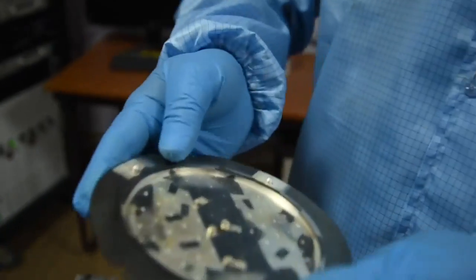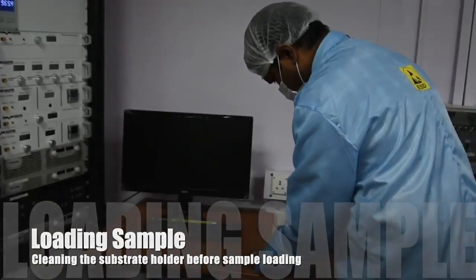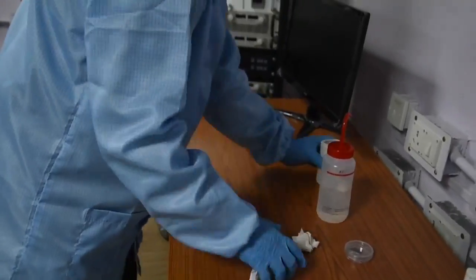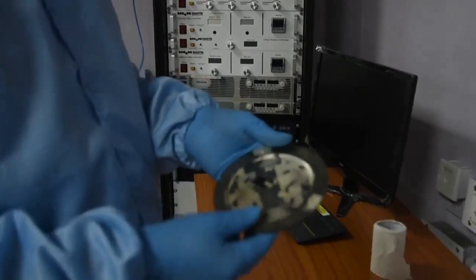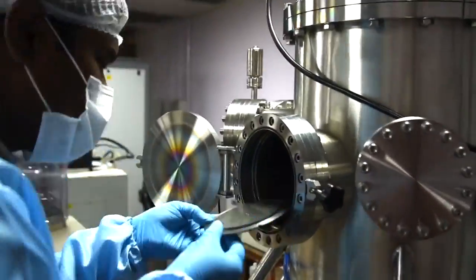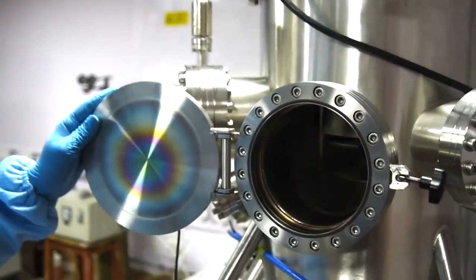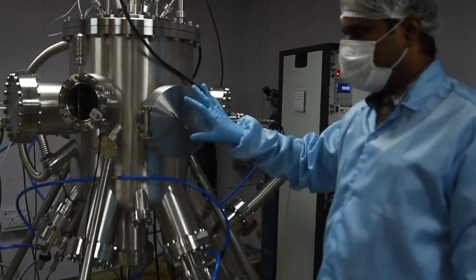This is the substrate plate where we can load the substrates. I am going to load the substrates now. I have placed the substrates on the substrate holder and I am making sure they are secure, because the substrate holder is oriented facing downward inside the vacuum chamber. The substrate holder is covered by a shutter — whenever we want to start the deposition, we remove the shutter so that deposition can begin. I am now closing the chamber. The substrates and target are loaded.